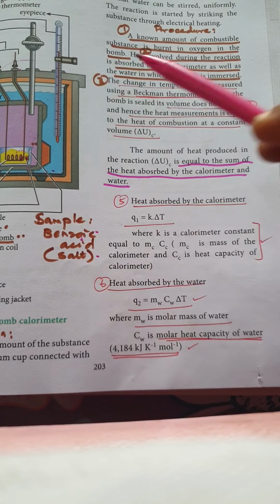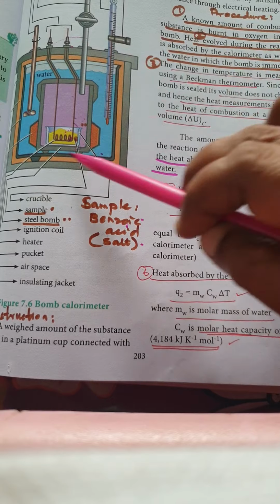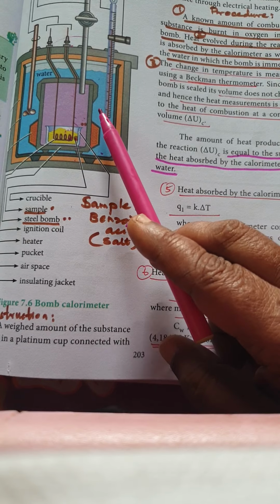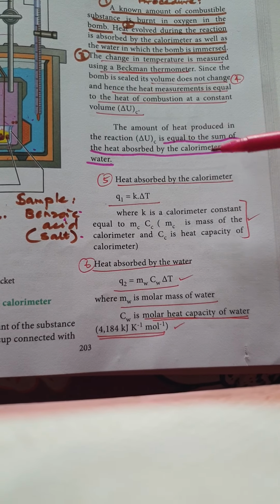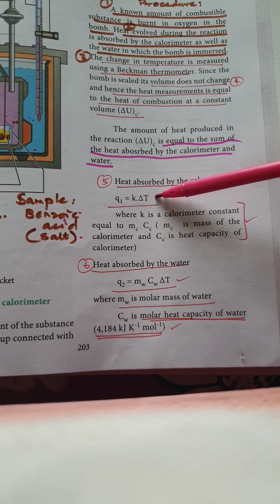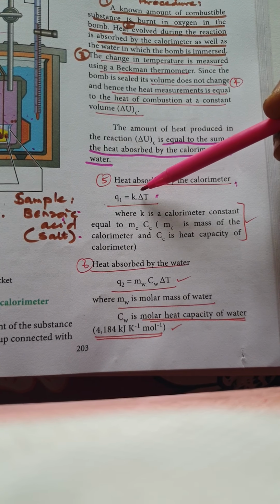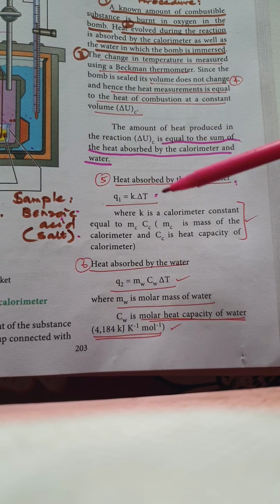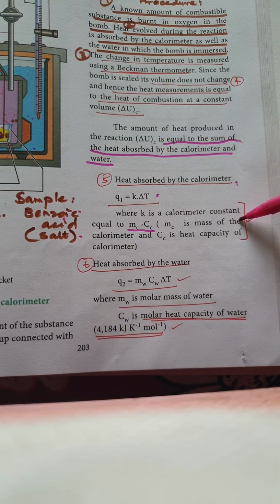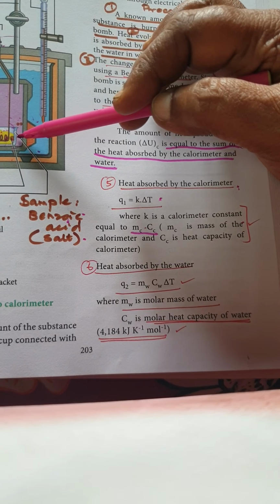The total amount of heat that is produced in this reaction by using benzoic acid in the bomb calorimeter is equal to the sum of the heat absorbed by the calorimeter and the amount of heat absorbed by the water. So two things I'm going to calculate. Now, how do I calculate the heat absorbed by the calorimeter? By using the formula Q1 is equal to K into delta T, where K is a constant called the calorimetric constant, and it is equal to mc into cc. mc is the mass of the calorimeter, and cc is the heat capacity of the calorimeter.